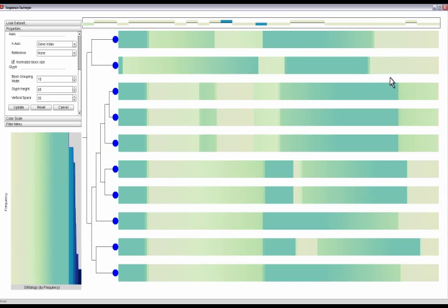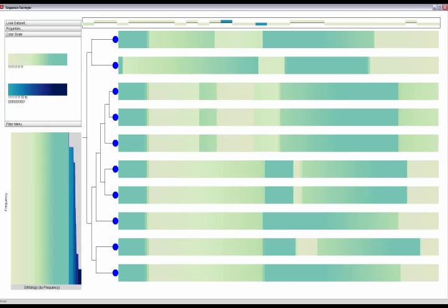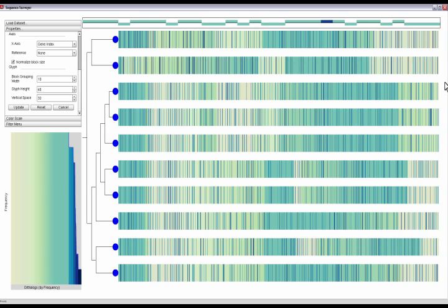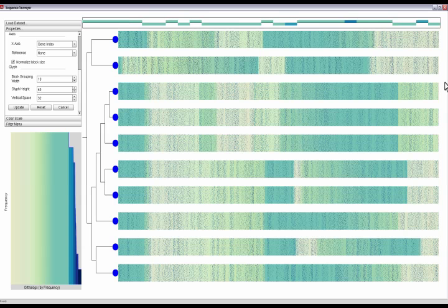Sequence Surveyor supports four aggregation schemes: averaging, robust averaging which shows dominant trends in the data, event striping that emphasizes outliers, and color weaving that conveys distributions.